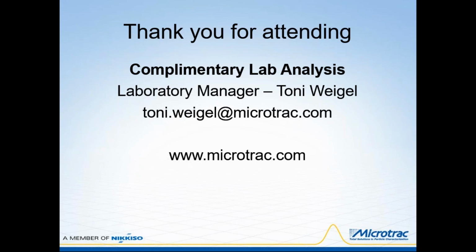Great. So Steve also would like to know, is the procedure accepted in ASTM D4791? It's in the process of being evaluated by several of the DOTs for measuring aggregates, and so we're working towards that end, and they're using one of our instruments for a complementary cooperative study. So we're aiming in that direction.